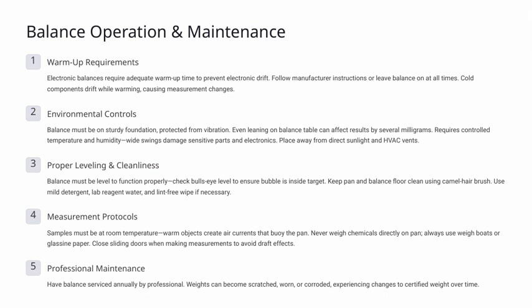A clean, level balance ensures reliable results. Moving on to measurement protocols. Always ensure your samples are at room temperature. Warm samples can create air currents that disturb the pan.